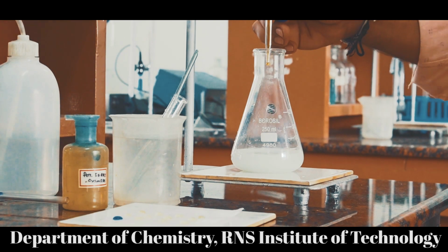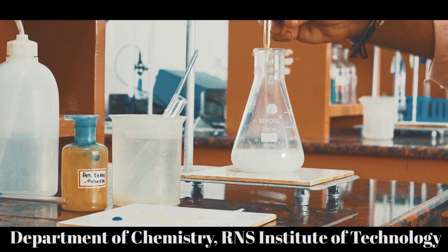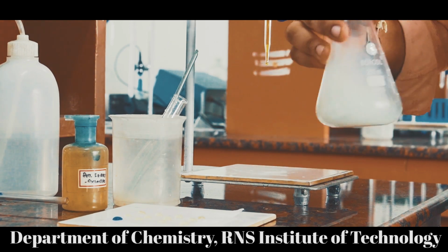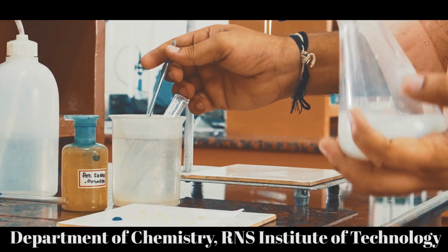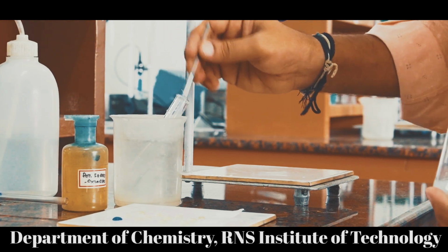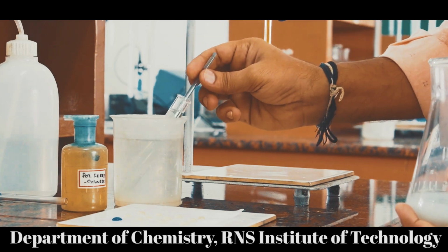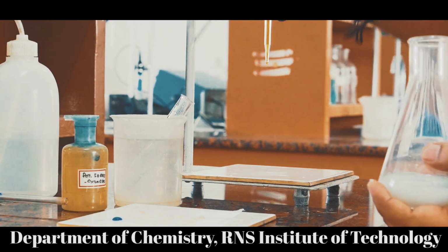After adding 7 ml, I will add 1 ml. So I will add up to 8, and now I will stop, because the first titration is always a rough titration. Here we are going to get the range. Before dipping this glass rod, make sure that the glass rod is washed first with tap water like this, and then rinsed in distilled water. Sometimes if you are not washing the glass rod properly also, you are going to get a color.